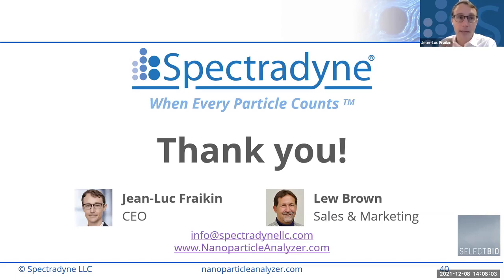Then Jenny Yang has asked, why does LNP sample profile seem to follow the Gaussian distribution, while other samples such as exosome samples show power law distribution with no peak appearing? There's a second part. Let me answer the first part first. That is a great question for you guys to answer as scientists and researchers of these particles.